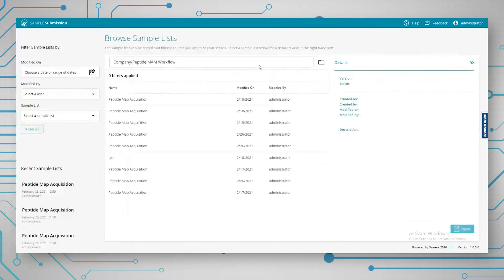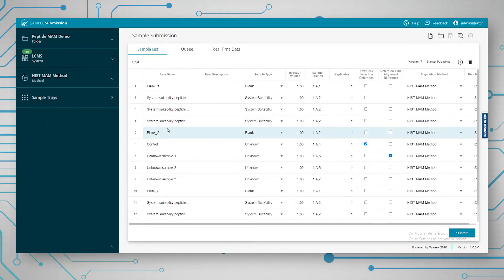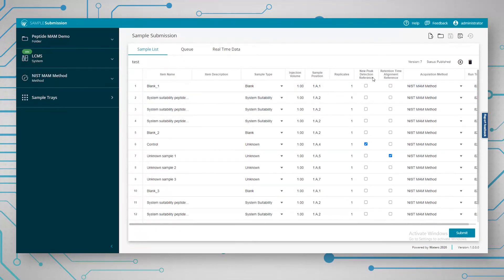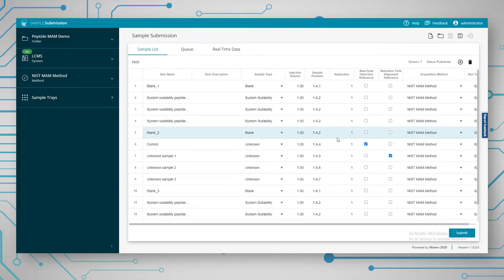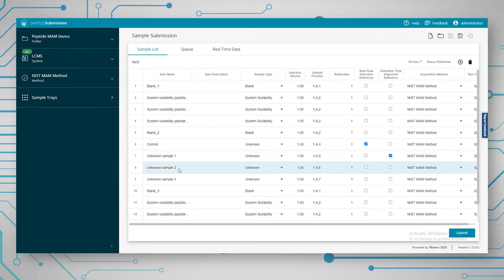We can browse our sample list, which contains the samples you want to inject. We've got the blanks and the system suitability samples — you run three system suitability samples, then another blank. Then there's the control sample and the three unknown samples that form the actual MAM analysis. The standard information includes sample type, injection volume, sample position, and replicates. We have to specify a new peak detection reference — which is the sample used to look for any new or different peaks — and a retention time alignment reference, which should be a real representative sample around the middle of the run.